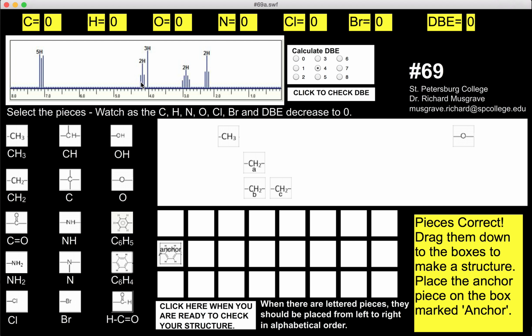What we can see here is we have a CH2 that's got 3 peaks, which indicates it's next to another CH2. This CH2 is quite interesting because it's got 5 peaks, indicating it's next to 4 hydrogens. That would be indicative of a CH2 between 2 CH2 groups. So that would be this one here. And that one would have 5 peaks.